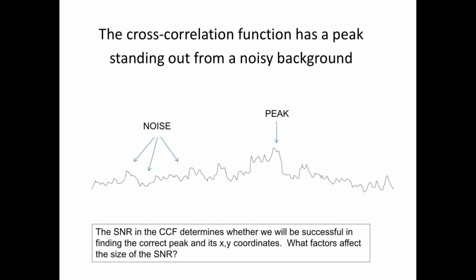Okay, but the cross-correlation itself is affected by noise. So you can have a very noisy situation, and then it might become difficult to recognize the peak standing out from the variations of the background.